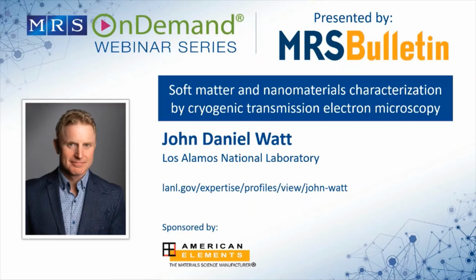And there are two things you want to do. One, not let it go above the phase change to crystalline ice, which is about minus 137, 138 Celsius. And the other one is obviously you don't want it to melt. So there are a number of things provided by vendors of TEMs and plunge freezers, transfer stations and things like that. But at the end of the day, you have to be very careful, very meticulous in terms of loading the sample onto the TEM.